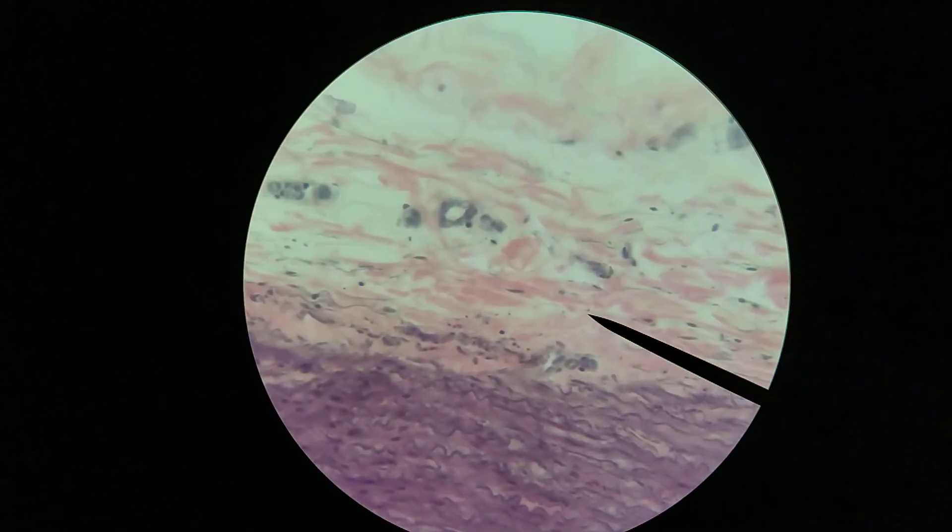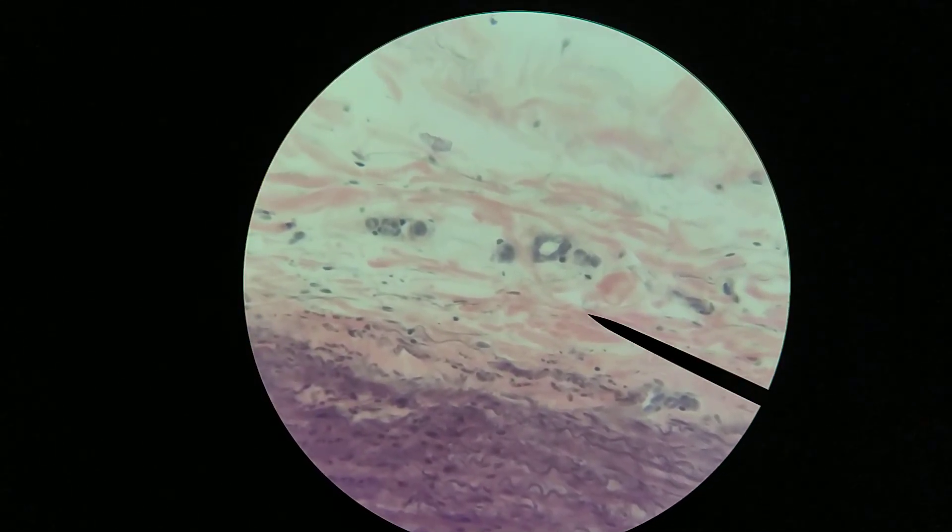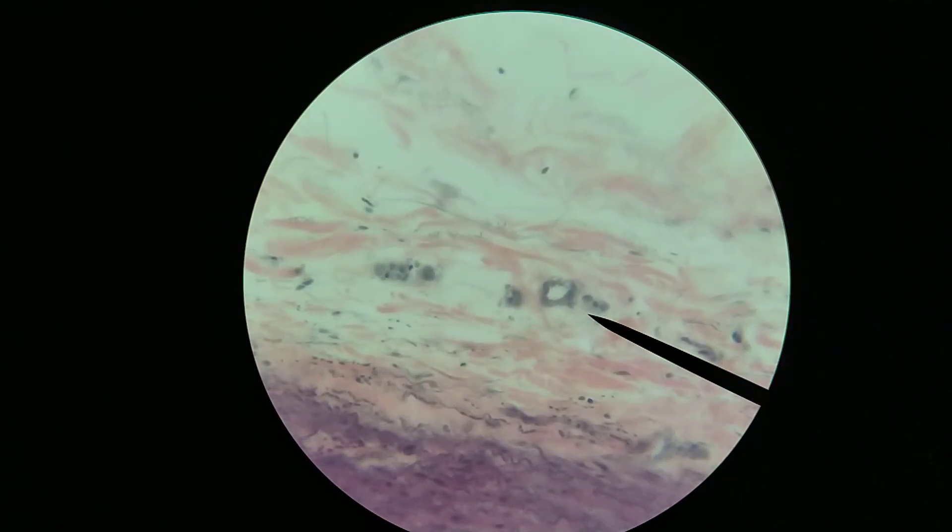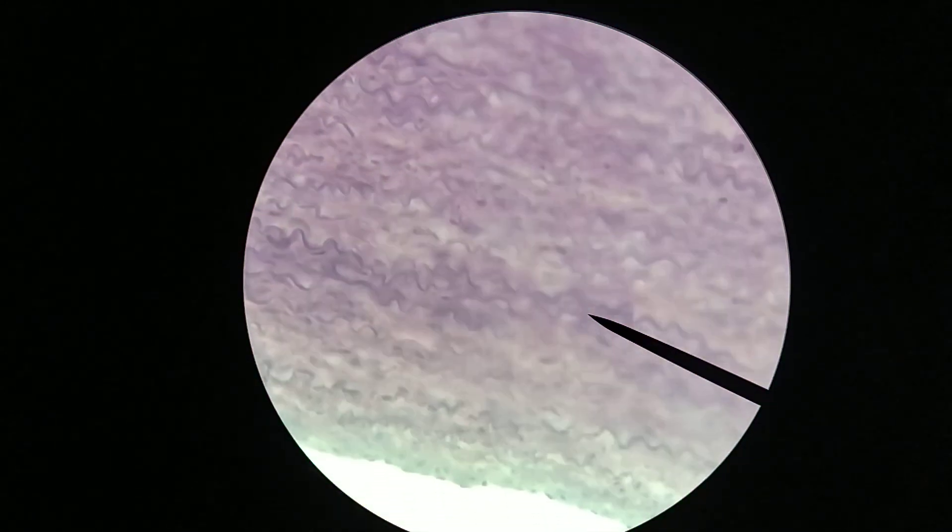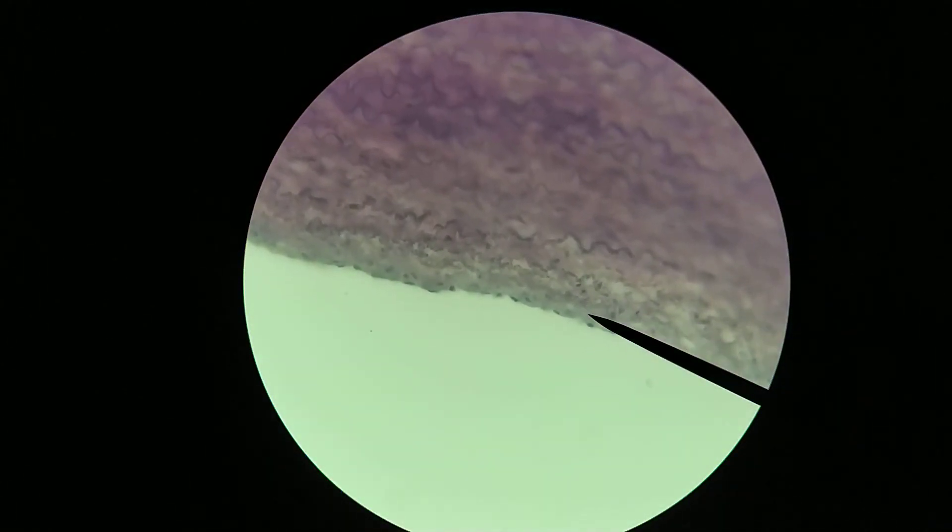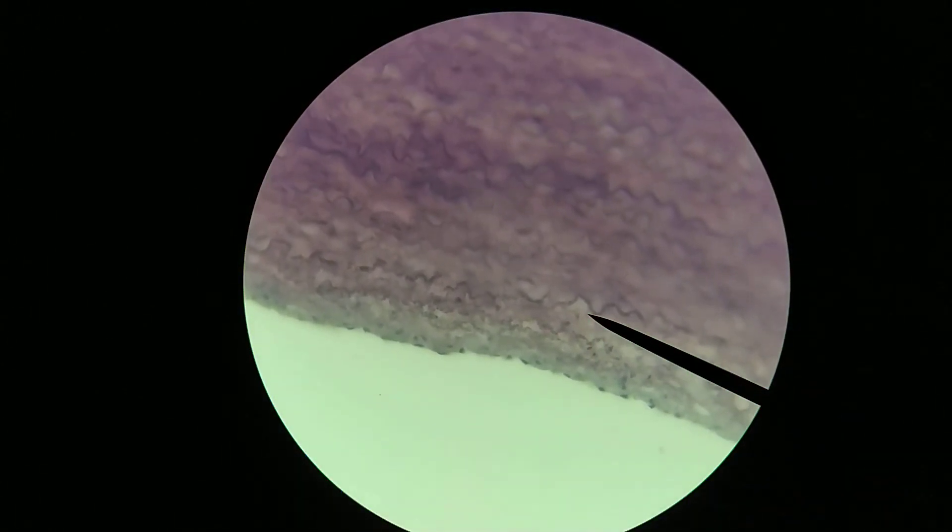So again, just because there's blood going through the interior of the lumen doesn't mean that that blood is going to be able to feed all these layers of cells around the outside. So you might have a few layers up here that might get fed from the lumen.